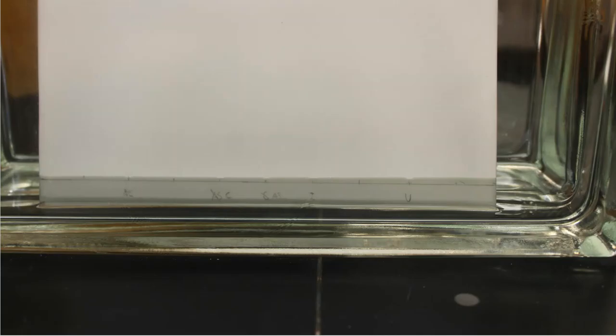So this is what they begin to look like. This is the very first tank, and as you can see, the level of the mobile phase is down here, all right? And quickly, it has begun to suck up that mobile phase inside of that chamber. So I'm already seeing migration beginning to happen.